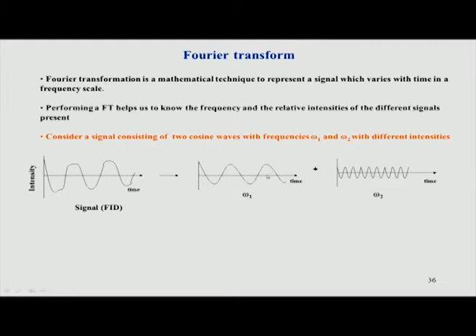You can see the frequencies are not the same now because they are two different atoms in the same molecule, and therefore they have two different frequencies, and these two different frequencies also have different amplitudes. You see the height is also not the same here and here. That is because this particular frequency may come from 3 hydrogen atoms, so 3 times the signal of this one, which may come from 1 hydrogen atom. So, you see that is the difference in NMR.